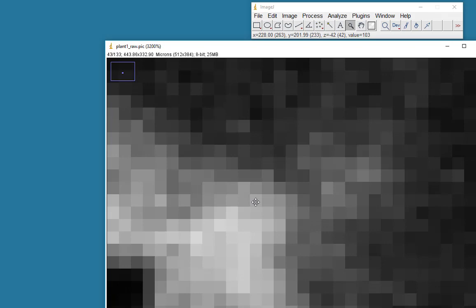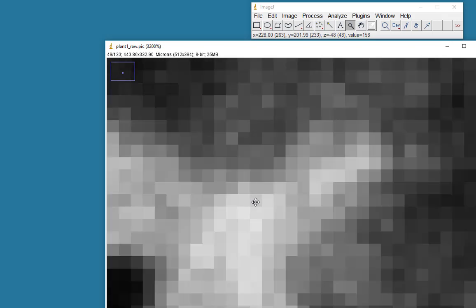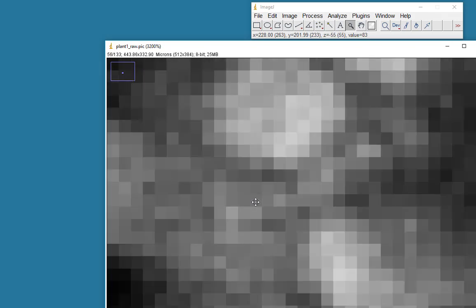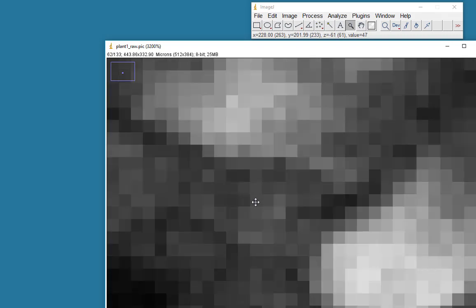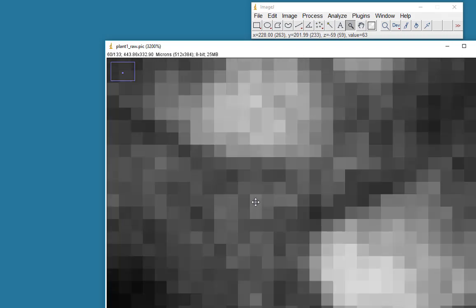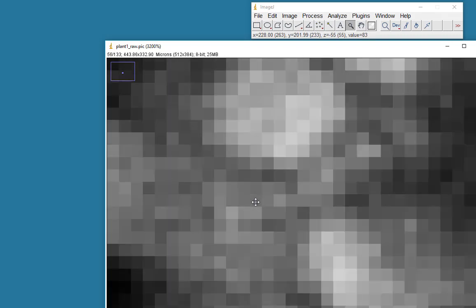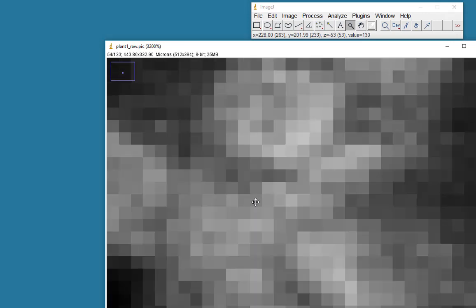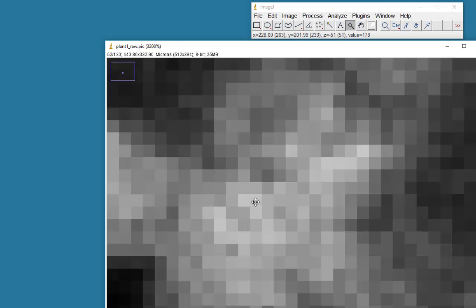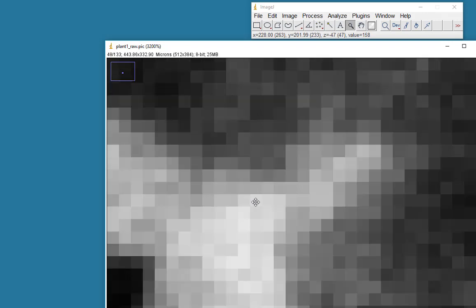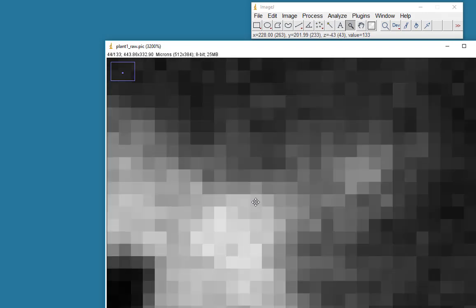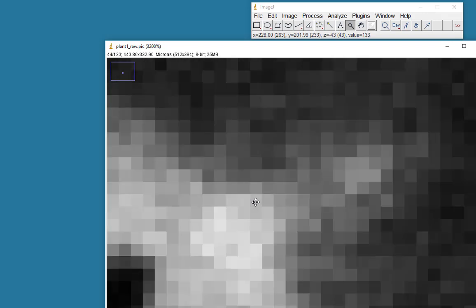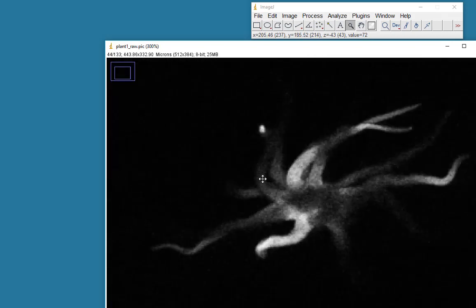So there's a variety of intensity values at that single location. We will use those numbers to make the Z projection. A maximum intensity projection would be an image which represents at that pixel location the highest intensity value, the highest intensity value in this column of data. It should be a bit clearer as we make the image.